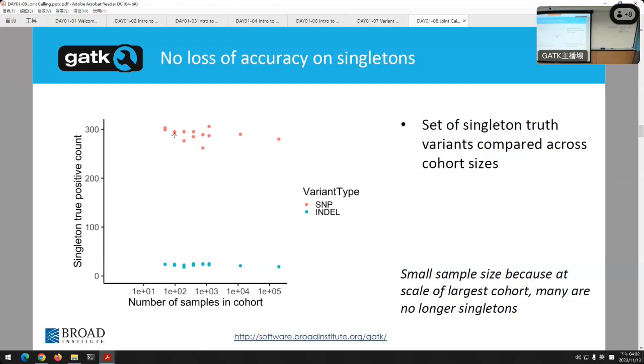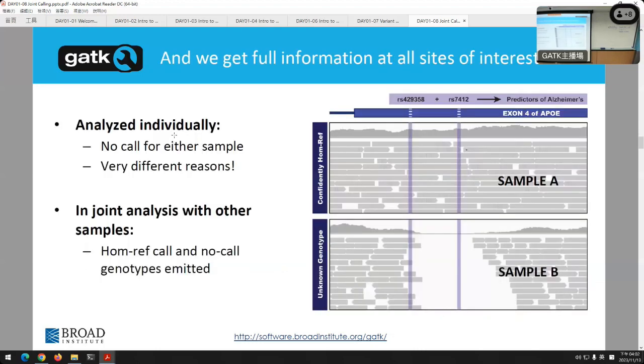And it's important to note that it can also be noisy to have to go in and filter out a cohort and everything else. It can be, but the beauty with a lot of joint calling is that even if you have a variant in there that you're maybe less sure about, a lot of joint calling pipelines do soft filtering. They'll flag it and say, oh, I'm not sure about this one, give it a confidence score. It'll still be in there though, because depending on what you're looking at, you might want to look at those.